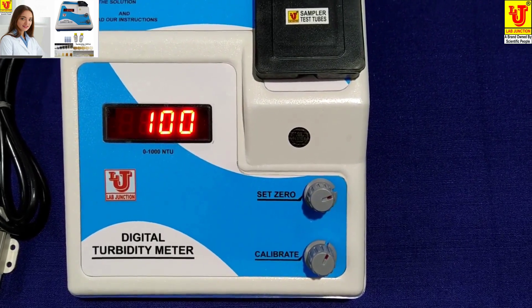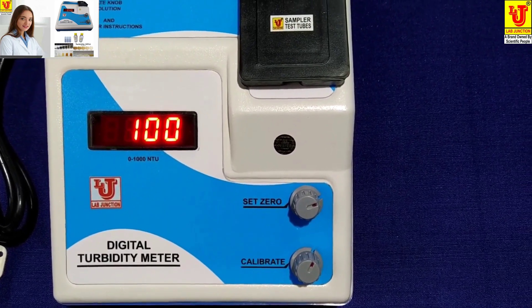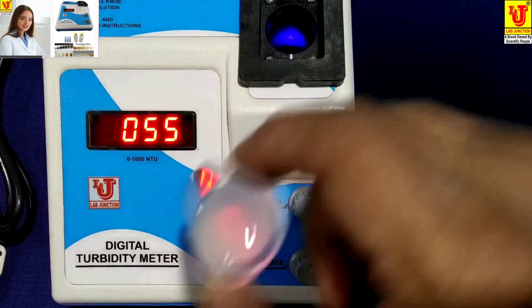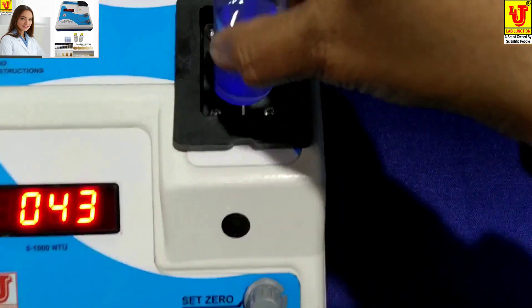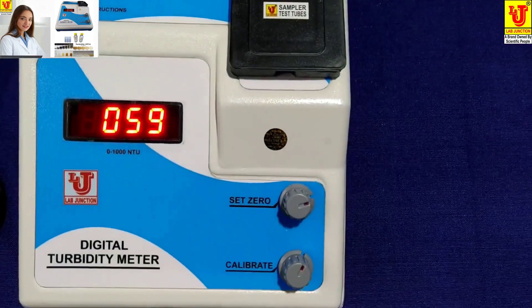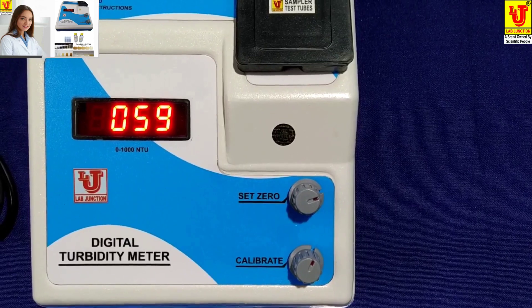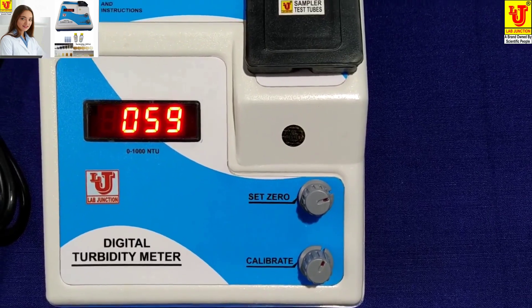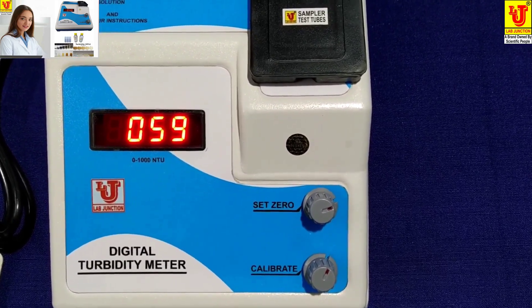Now your digital turbidity meter is calibrated. Now you can test your samples. This is my sample — my sample reading is 59 NTU per JTU. Note down your reading in your notebook and test another sample. Thanks.